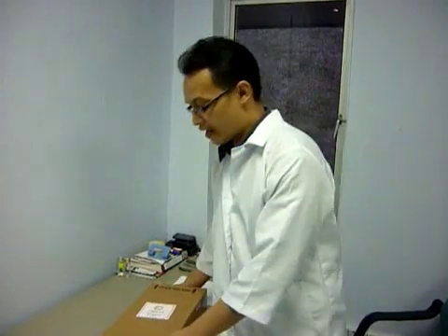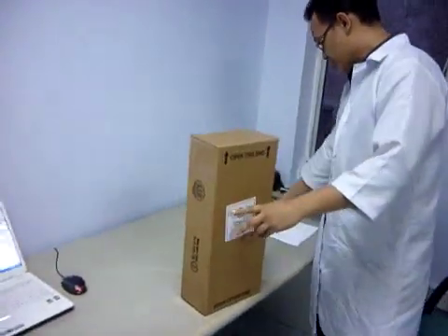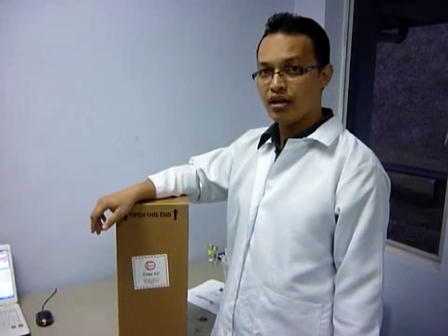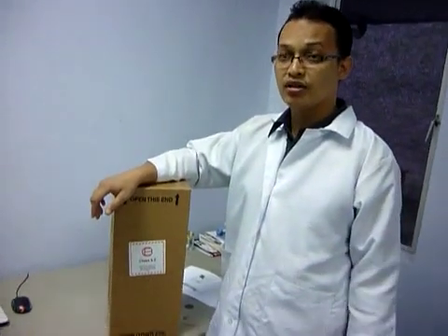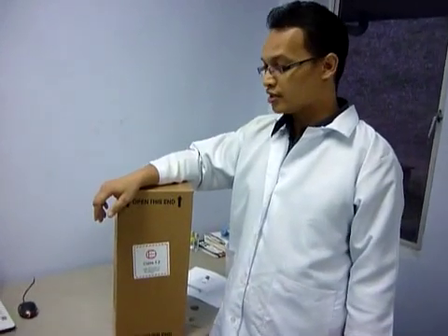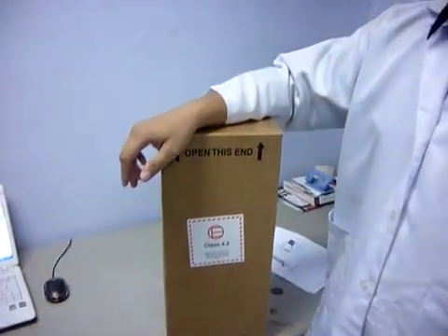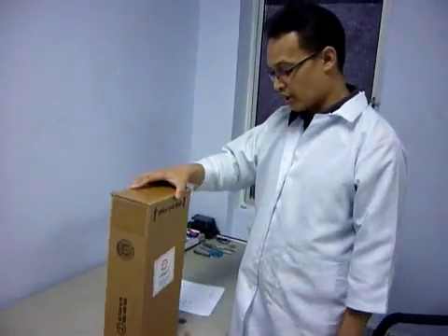Hello, today I'm going to show you the unboxing of this renewable purifier cartridge. This is to be installed for the GC because, as we know, we have helium gas, compressed air gas, and some GCs that have hydrogen — meaning those using FID will use hydrogen. So we need to install the gas purifier or filter in order to protect our GC.